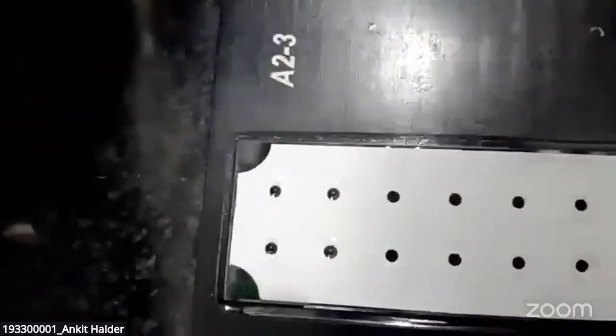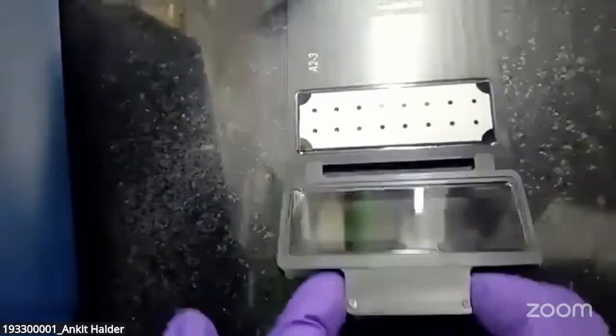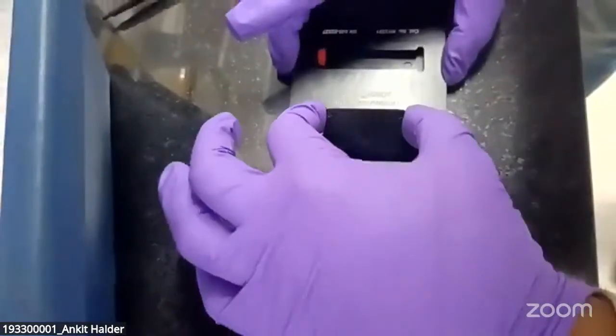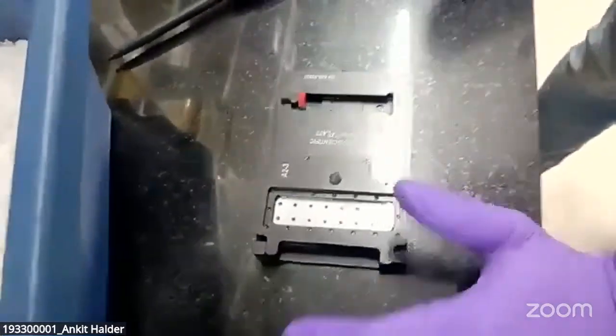So you can see the drops on the micro droplet plate. Now I will close the lid. So your micro droplet plate and your samples are ready.